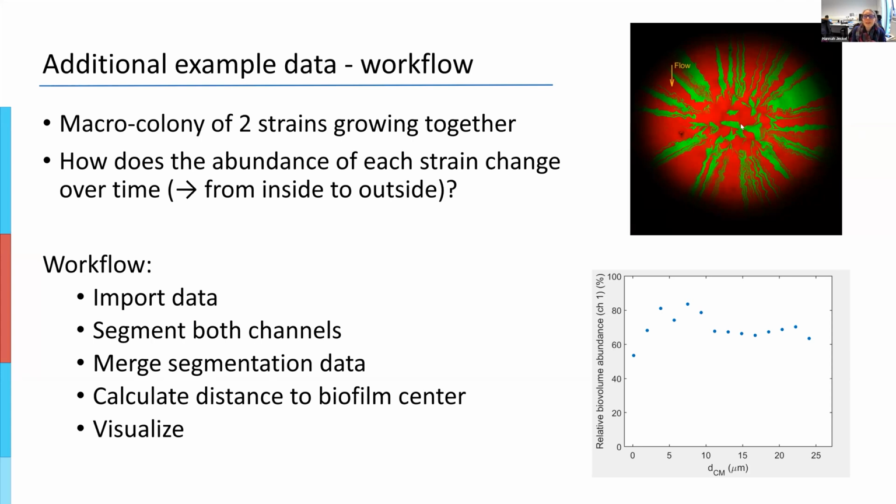because the space is also beautifully capturing time. As the cells are growing outwards, they start out in the center of the plate and they grow outwards continuously. Therefore, this is sort of our time axis. So as we explore this colony, we are going to refer to time, or over time, as from inside to the outside of the colony. And this is, of course, again, the spatial measure of distance to the biofilm center or distance to the biofilm surface, as you wish to define it. And this is something that we can calculate in BiofilmQ.